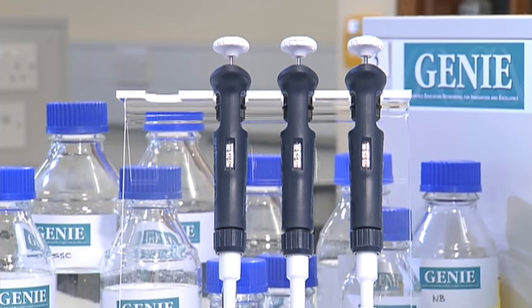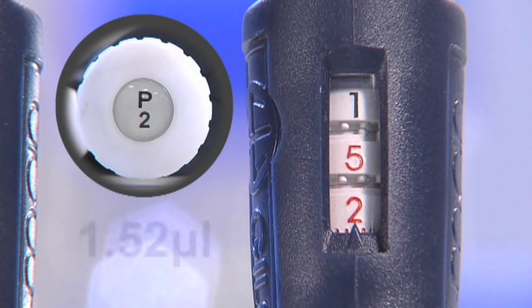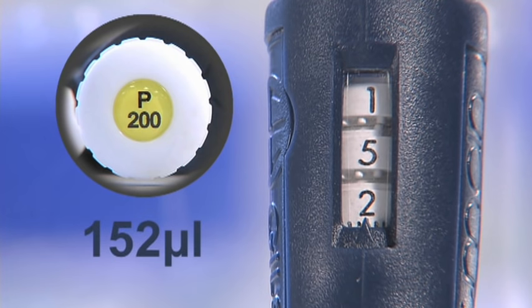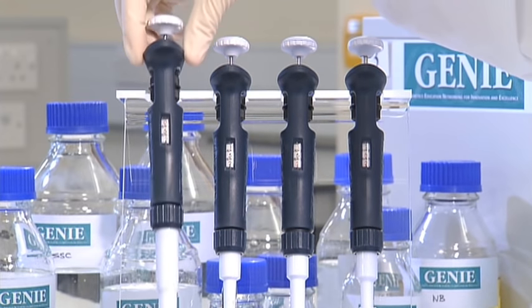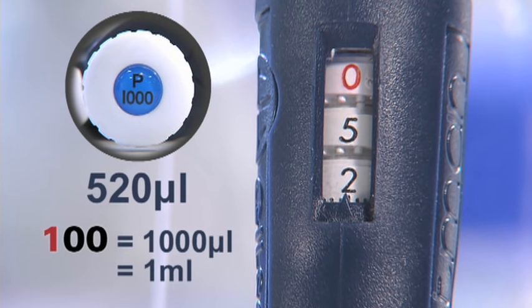For example, these three pipettes have been set to read the same numbers on the dial: 152. For the P2, this means the pipette is set to 1.52 microlitres — the bottom dials are in red indicating 5 tenths and 2 hundredths of a microlitre. For the P20, this means 15.2 microlitres, with the red bottom dial showing 2 tenths of a microlitre. For the P200, the same visual setting means 152 microlitres. The P1000 set to 052 indicates 520 microlitres; a setting of 100 indicates its maximum of 1,000 microlitres, and the uppermost number in red indicates millilitres.